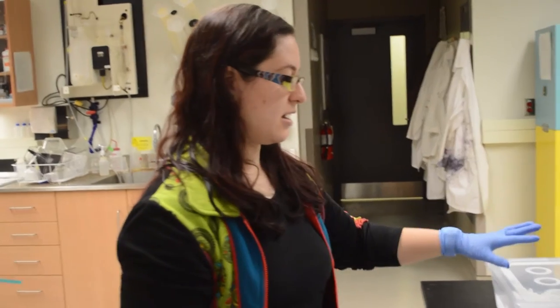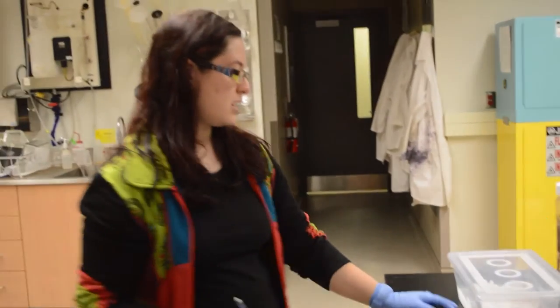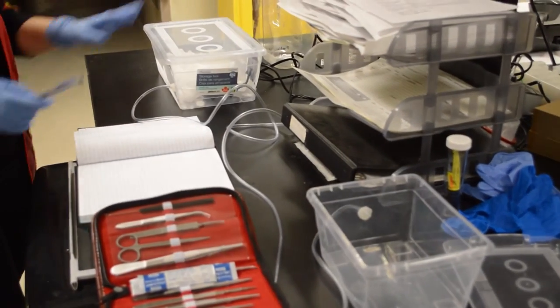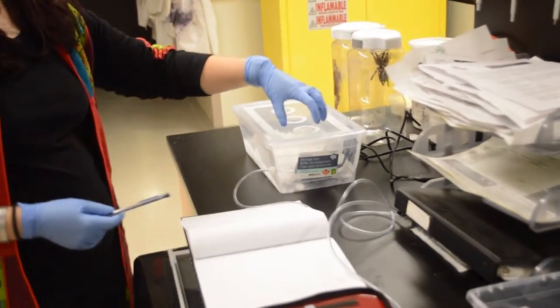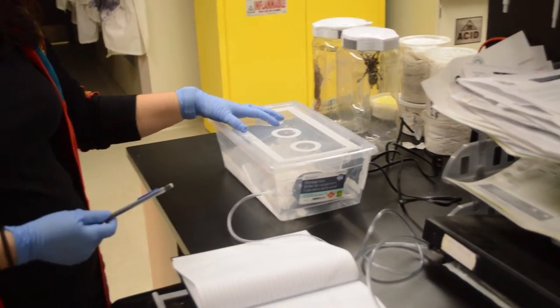In order to get hemolymph — which is tarantula blood, more or less — safely from the specimens, we have to sedate them first. The method we're using for that is CO2, carbon dioxide. We've rigged up this sedation chamber, which is basically two containers connected by aquarium airline tubing, and we have an air pump inside the larger container, which also contains the dry ice.